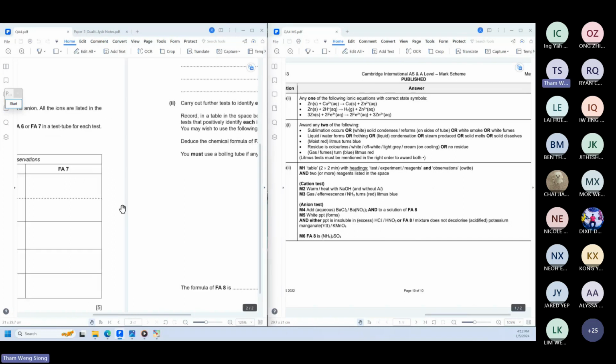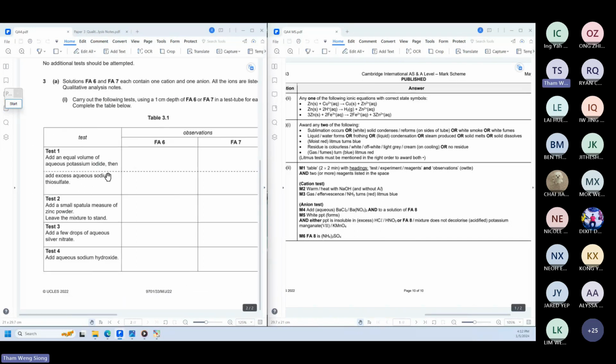The only ones I want to go through are these, because this particular one is very tricky. I cannot go through every single one of them because there's too many weird things, but hopefully I go through many of them. So tomorrow if you see weird stuff, just remember some of them are noise, and some of them will lead you to the correct cation and anion test. Don't get confused. Don't try to explain everything. It doesn't work like that.